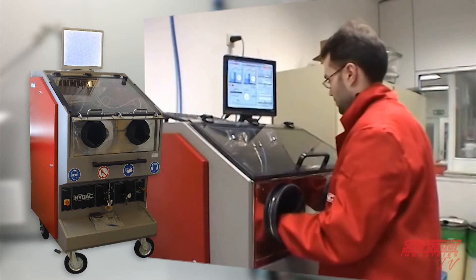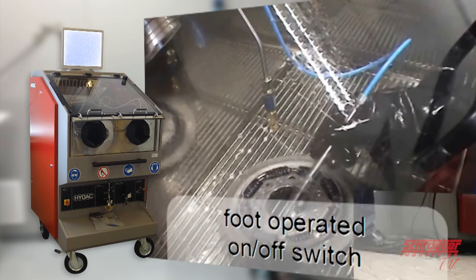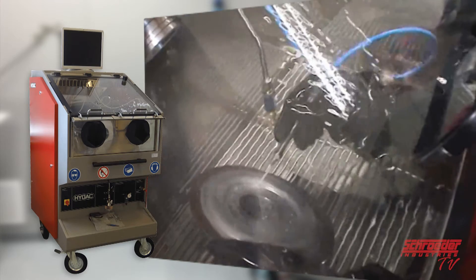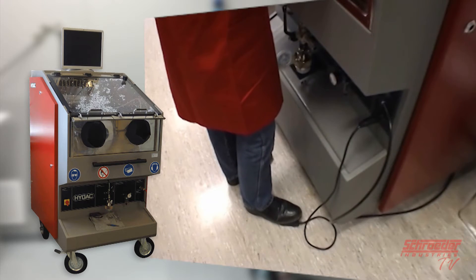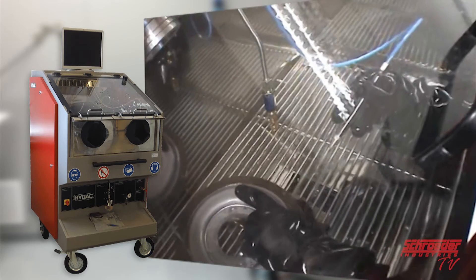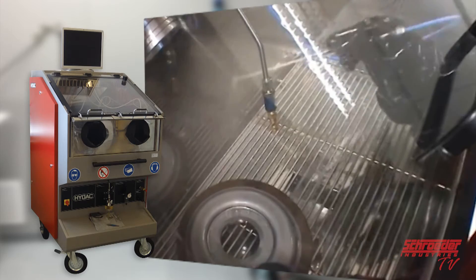The operator can either start a program sequence or manually start and stop the flow of fluid by a foot pedal for starting and stopping the rinsing process. At the end of a rinse cycle, the user will want to rinse off the included gloves in the clean box to collect all particulates for a complete and accurate reading.